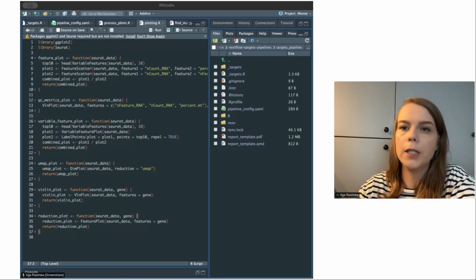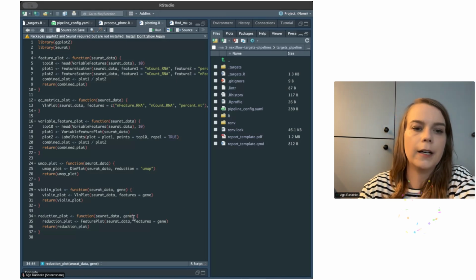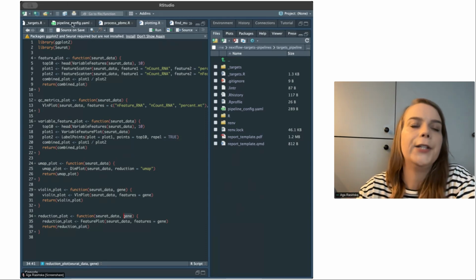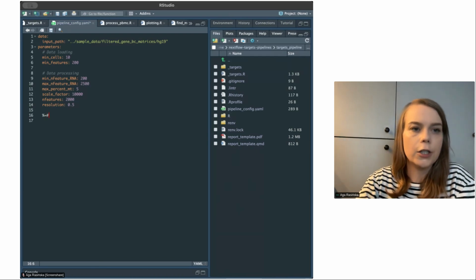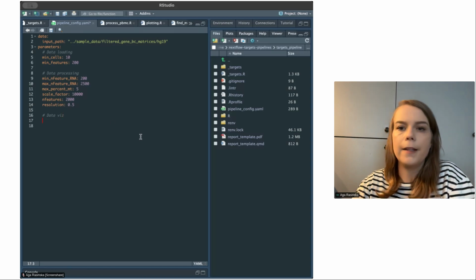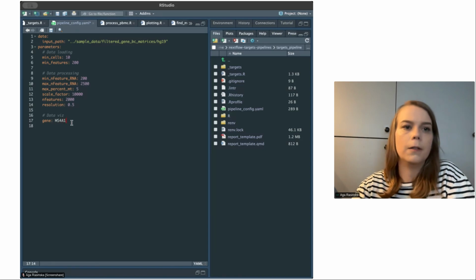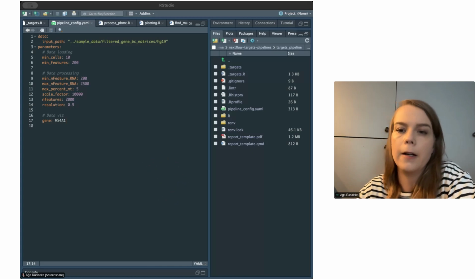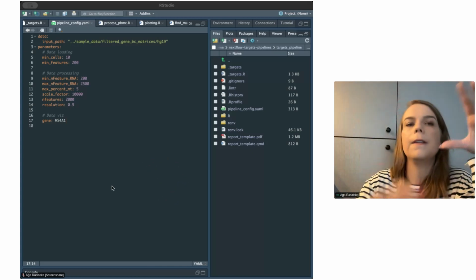Okay, so we have plotting, we have it, but another thing, we are using another gene over here because we will be interested in a particular gene to be used. So let's do data visualization. That's our data viz. And then let's say the gene will be MS4A1. Okay, we have it all. So we added some plots, we added some processes, but we added them within the small blocks.